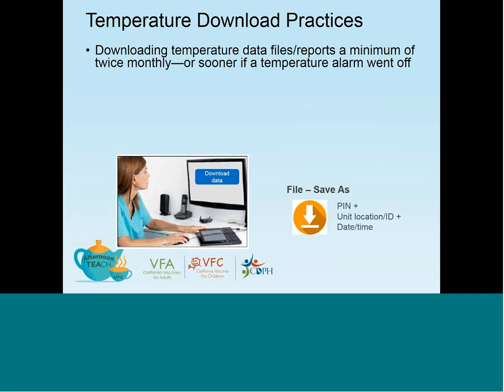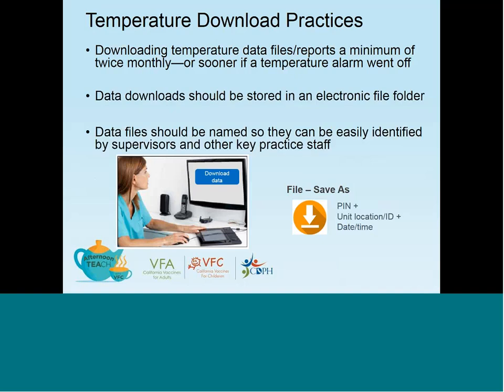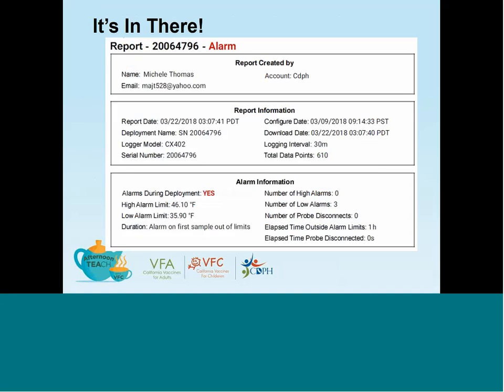Data downloads should be stored in an electronic file folder on your computer. Data files should be named so that they can be easily identified by supervisors and other key practice staff. There is a wealth of information that can be gained from reviewing and analyzing reports or the data files generated from a data logger. We're going to take a look at a couple of those reports so that we can see what we can learn from these different reports.